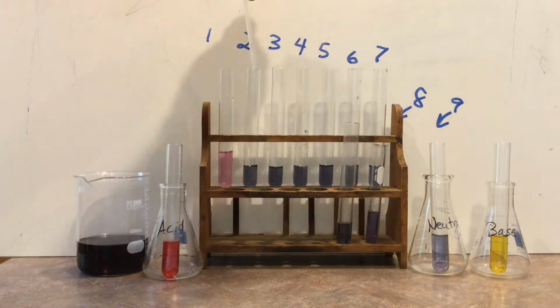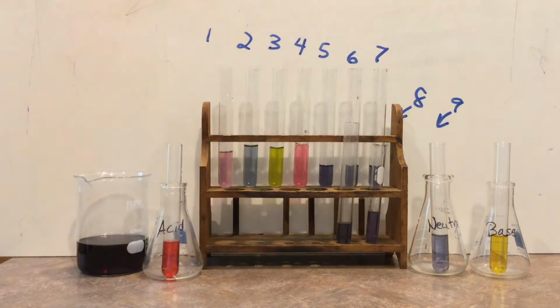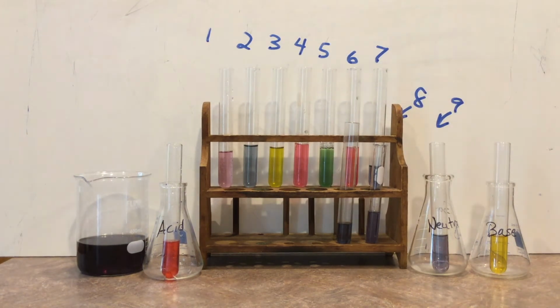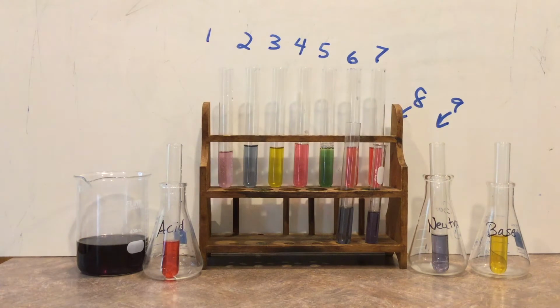Now unknown number 2. Unknown number 3. Next, unknown number 4. Now unknown number 5. Unknown number 6. Unknown number 7. Unknown number 8. And last but not least, unknown number 9.